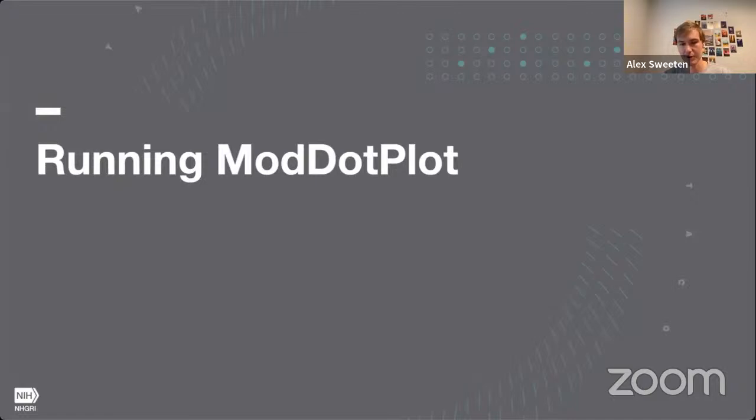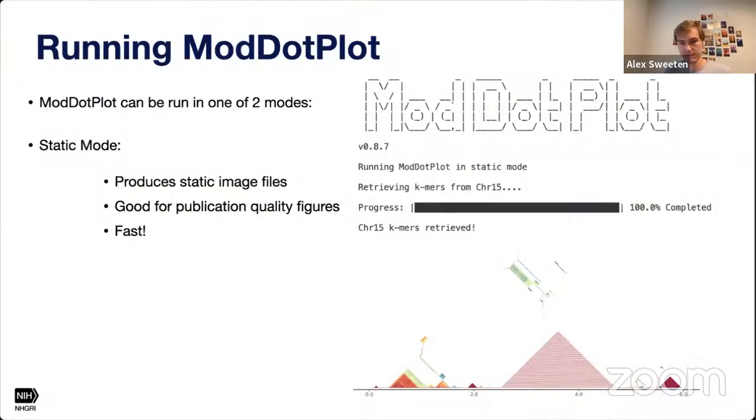All right, so hopefully I've given you some confidence in how to interpret a dot plot. So now we'll go more to the interactive session of this tutorial, which is running ModDotPlot. Essentially, ModDotPlot can be run in one of two modes.